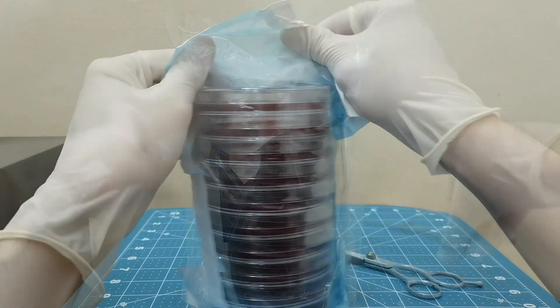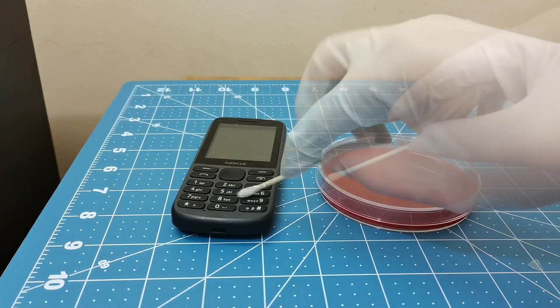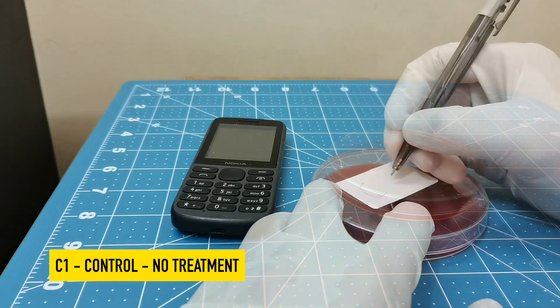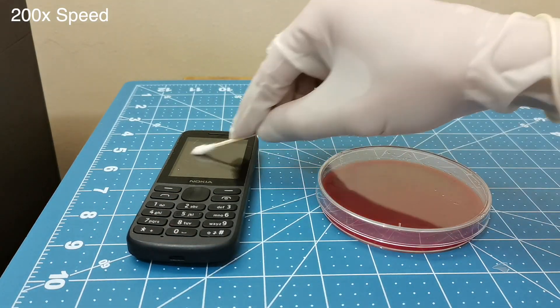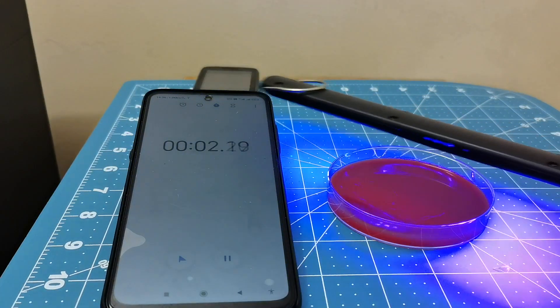Let's go one step further and actually do swab tests with blood agar plates. The first step is to remove the plates, then we're going to swab a cell phone and apply that swab to a control petri dish — that will have no treatment, we'll just leave that by itself. Then we'll take another swab of the cell phone, apply it to a petri dish, and treat that dish with 60 seconds of the fake UV wand.